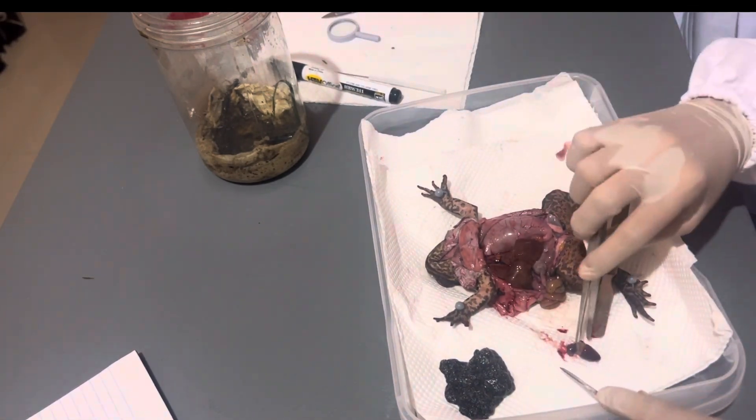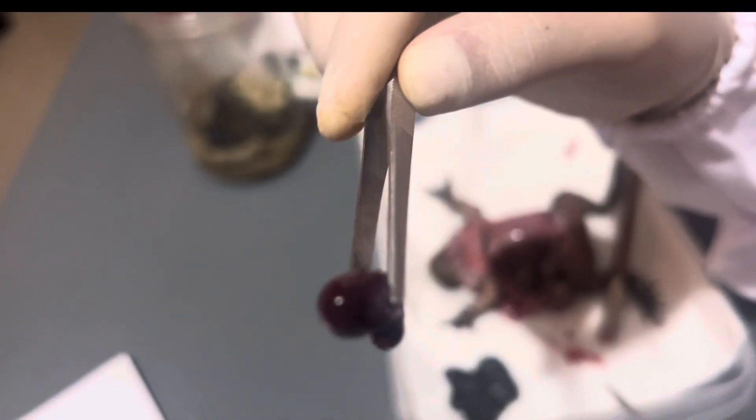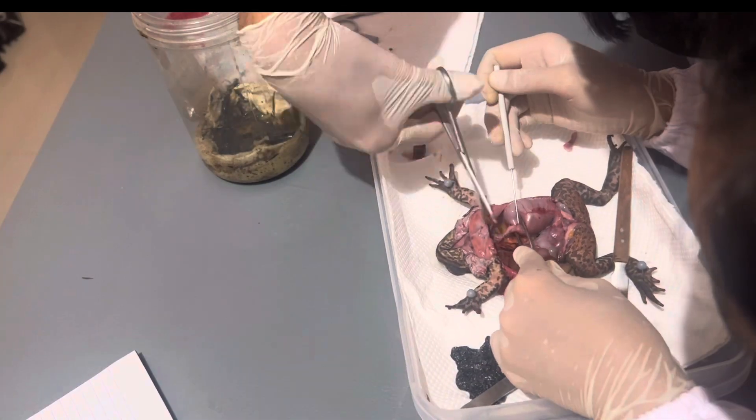This is the heart of a toad. Compared to humans, we have a four-chambered heart, while frogs have three-chambered hearts. Ours have two atria and two ventricles, and frogs have two atria and one ventricle. This is where blood gets pumped in and out of the body — both oxygenated and deoxygenated blood are circulated every second.